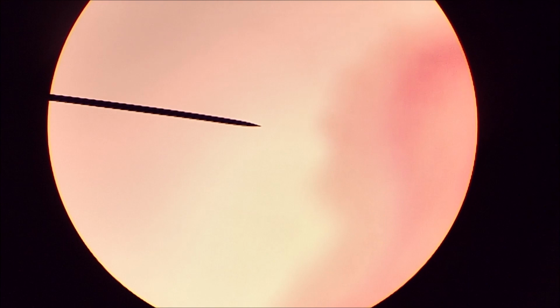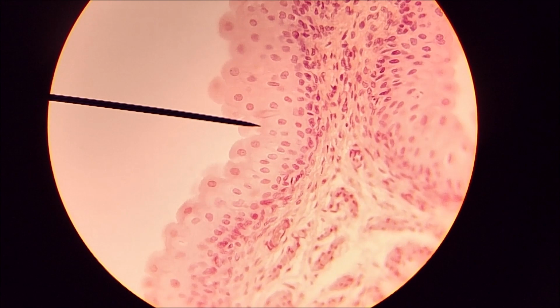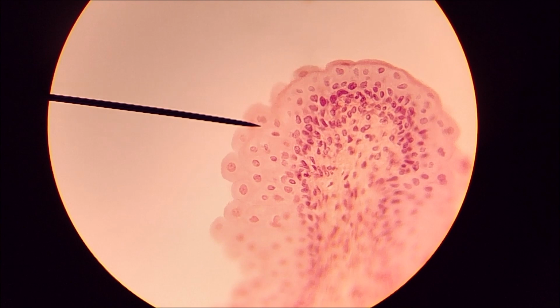And let's focus. These are the little round cells, you can kind of make those out, of transitional epithelium. You can imagine these becoming quite flat when necessary, when the bladder fills, and then coming back to this round shape when the bladder is empty.